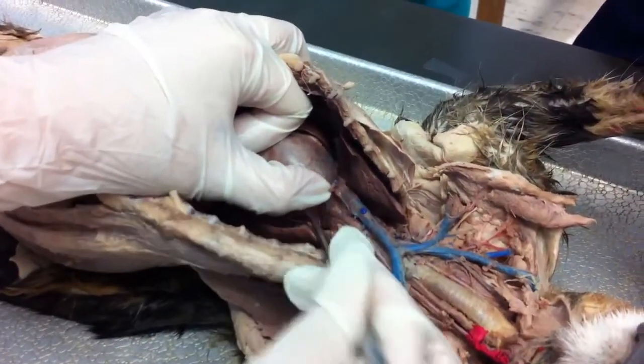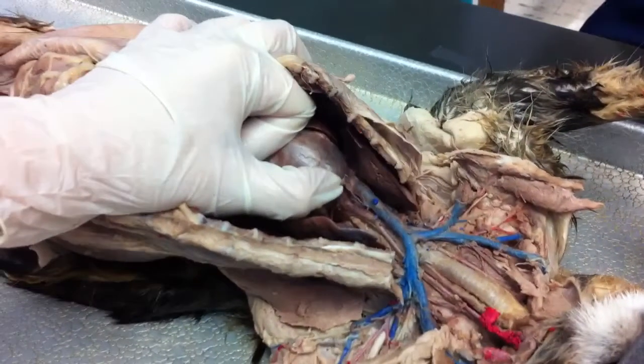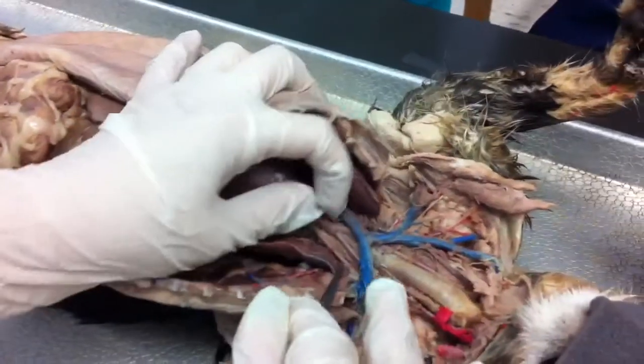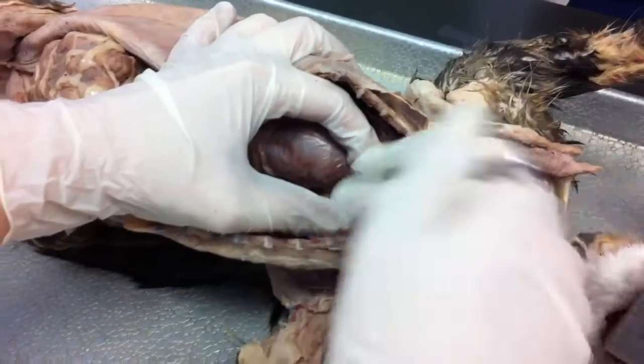Okay. And then last but not least, you can't really pin this guy, because I would have to basically take out the heart and take out the lungs to show it. But it wraps back around behind the heart. That's the thoracic aorta. I'm not going to pin it on the test. Okay. So now let's look at what comes off of these brachiocephalic and left subclavian arteries.